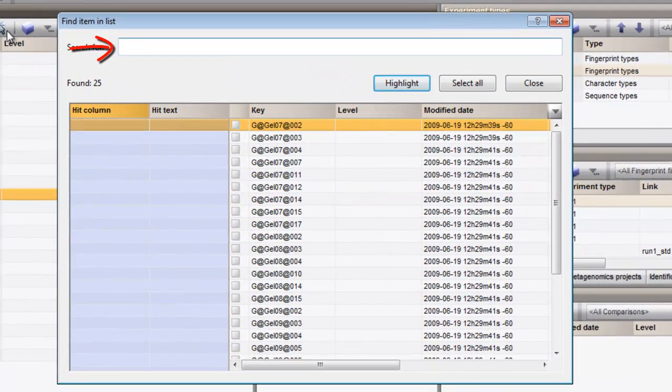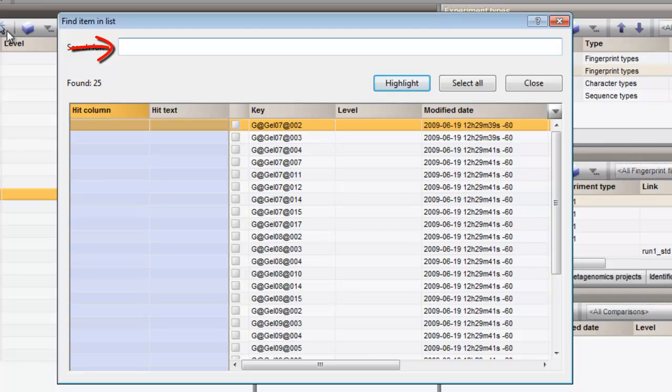In this text box you can type some text that will be searched for in all currently displayed fields. As an example, I will search for all Ambiorics entries in my database.